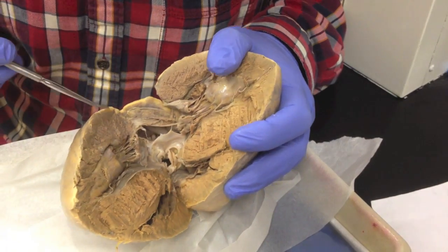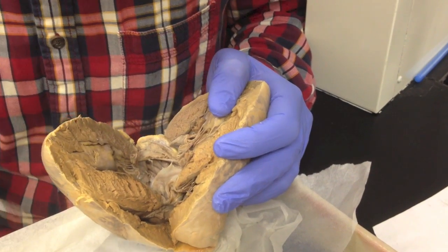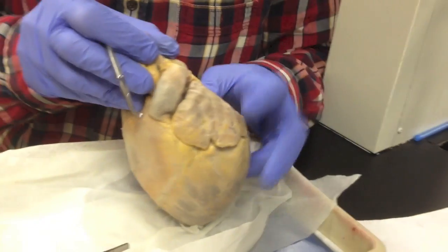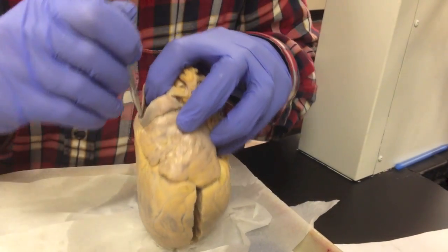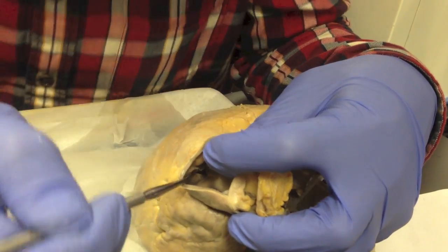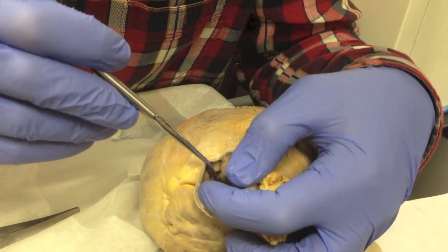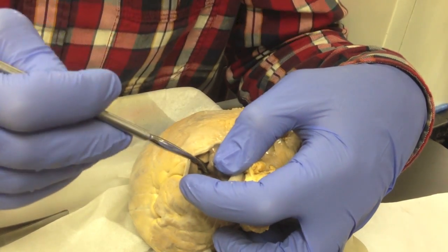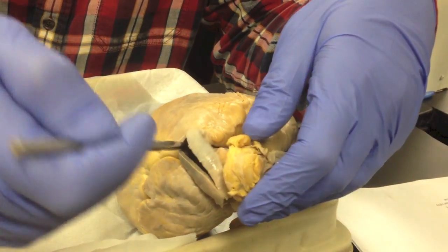The pulmonary semilunar valve — supposedly you could see that on the right ventricle, but it's very difficult on that kind of cut. So I go back outside and get to my pulmonary trunk, which is an artery, slash that open, and I can see deep there — those flanks, those folds that you see deep there — are the semilunar valves, the pulmonary semilunar valves. The only thing that is deep into the pulmonary trunk is going to be the semilunar valve. That's it.